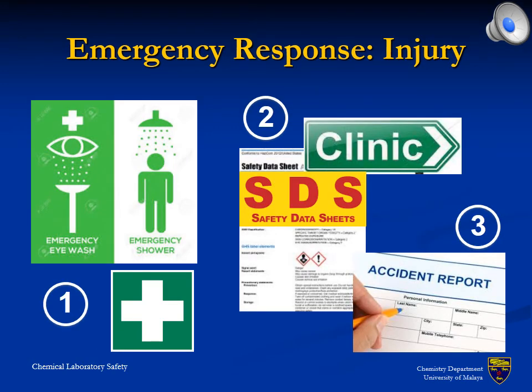Injuries inside the chemical laboratory frequently require immediate first aid. However, after this fast response, a specialist shall be contacted rather than resorting to self-medication. The safety data sheet for the chemical involved must be taken to the clinic to ensure proper treatment. Any medical treatment requires a subsequent filing of a report for the accident.